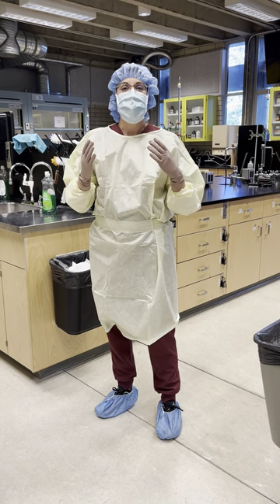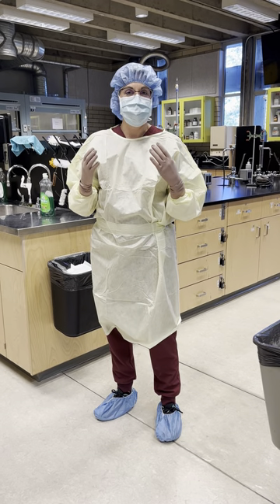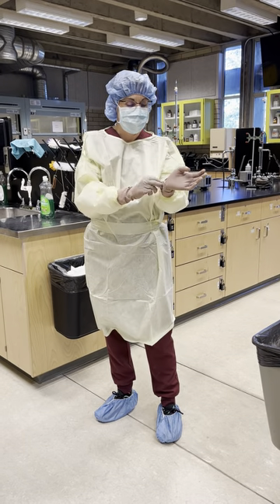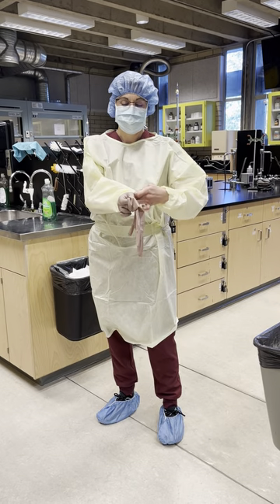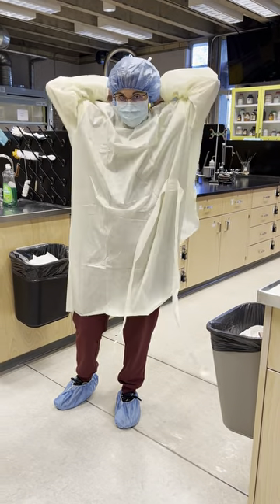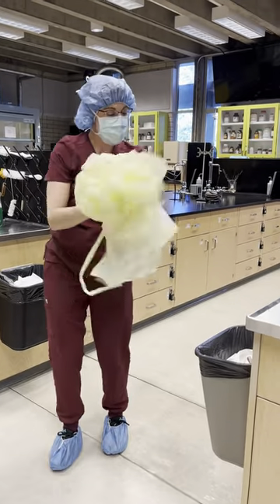For this lesson, we are going to practice doffing your personal protective equipment. So on the clean side of the anti-room or ante-area, you're going to remove your gloves and discard them. Remove your gown and discard it.